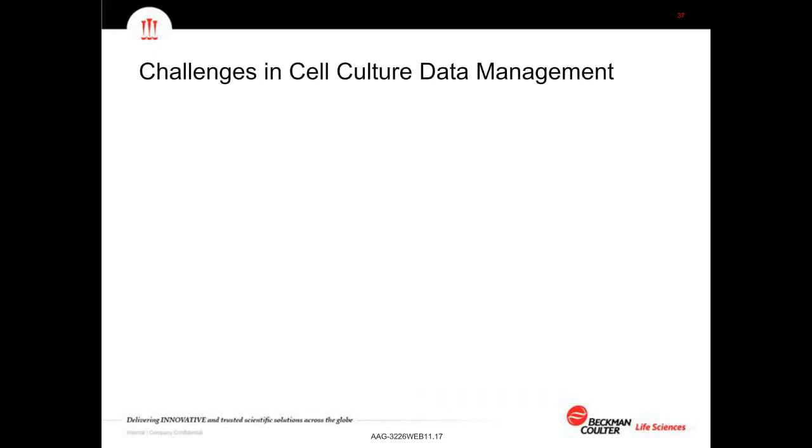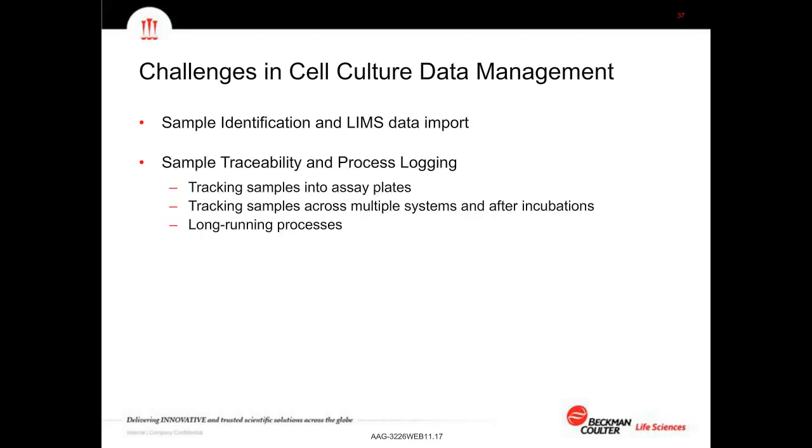These 4 challenges, first of all, we'll begin with sample identification. This may be coming from something that's entered. It could be from barcode reads. It could be from a LIMS, from a laboratory information management system. We need to then track these sample IDs through the entire process. Samples into assay plates, tracking samples across multiple systems and after incubations, track them through long-running processes. These are things that Russell referred to in his part of the talk today.